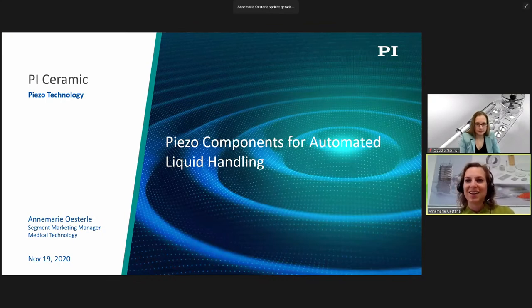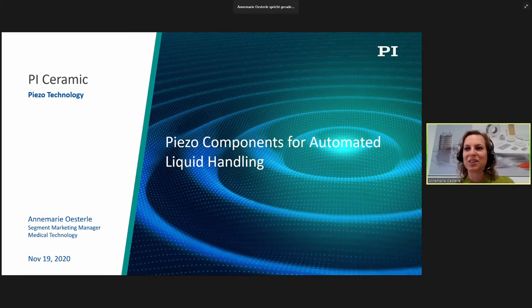So yeah, hello and thanks for organizing this nice session here and for the possibility to speak here within the topic of microfluidics. My name is Annemarie Oesterle and I'm the segment marketing manager for medical technology at the company PI Ceramic. PI Ceramic belongs to the company group of PI, Physik Instrumente. And we at PI Ceramic are the competence center for all things about piezo. And as the title of my talk already shows, I will present today an insight about the handling of small amounts of liquids with the help of piezo technology.